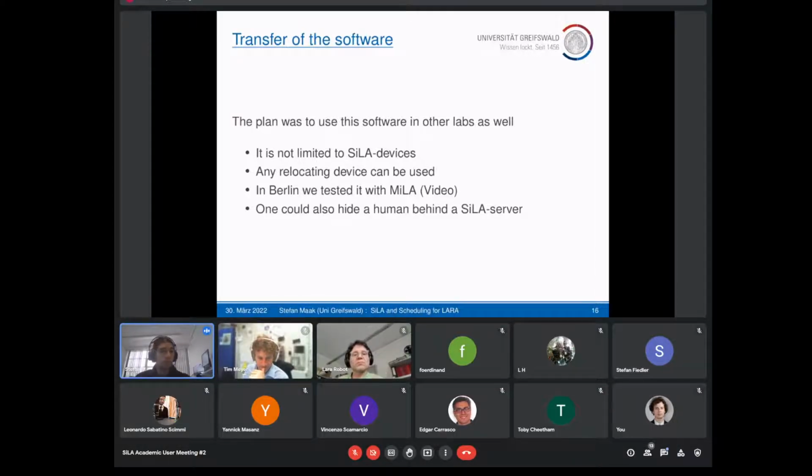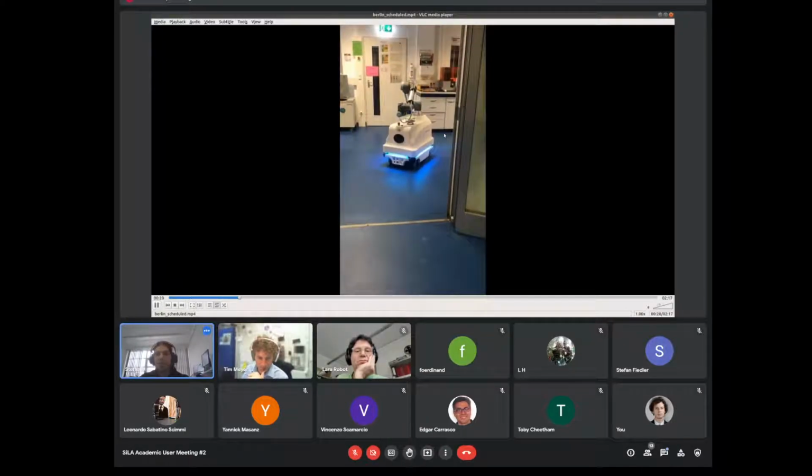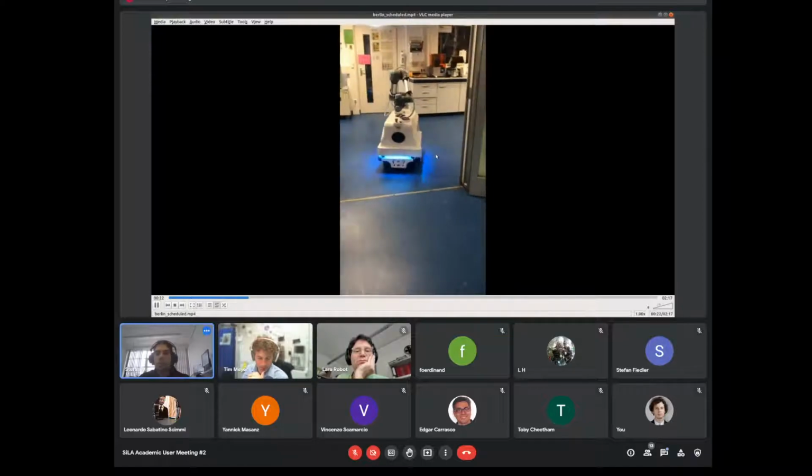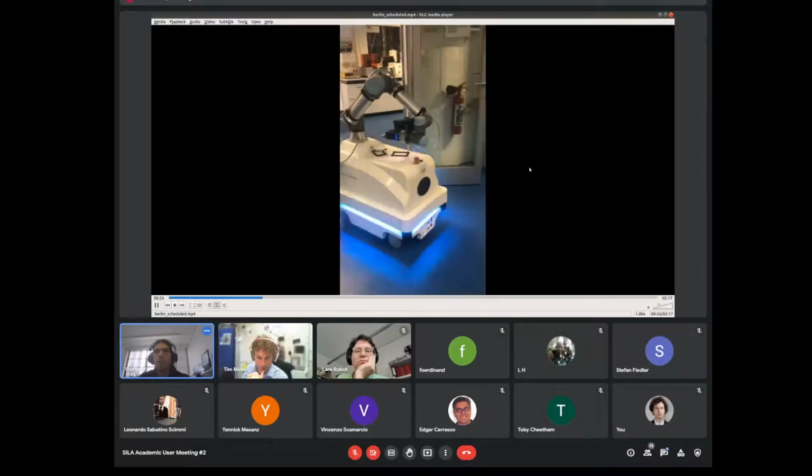I also brought you a small video of our mobile lab assistants in Berlin. You can see live what Adam described. This is a mobile lab assistant, which will transfer a plate from one place to another.